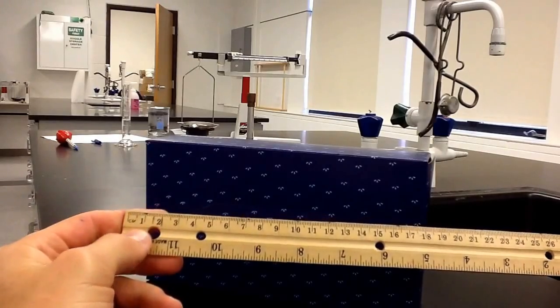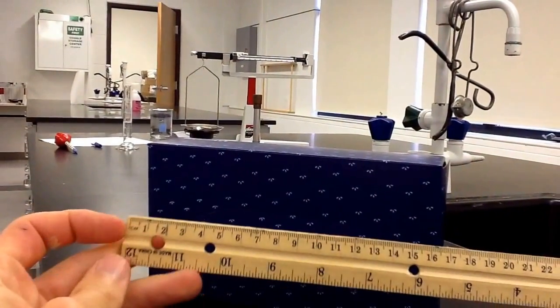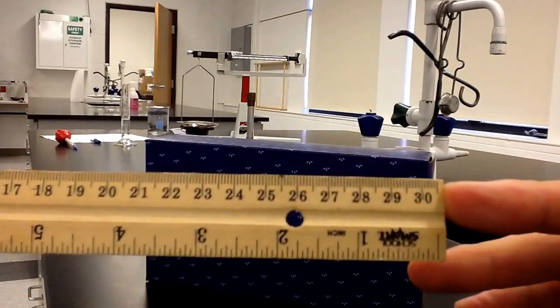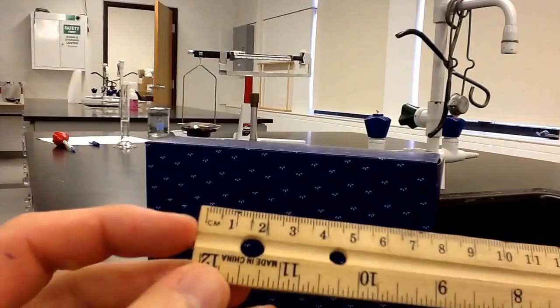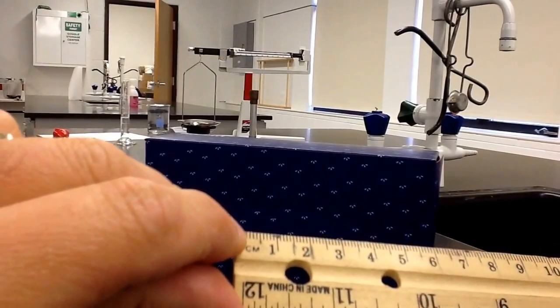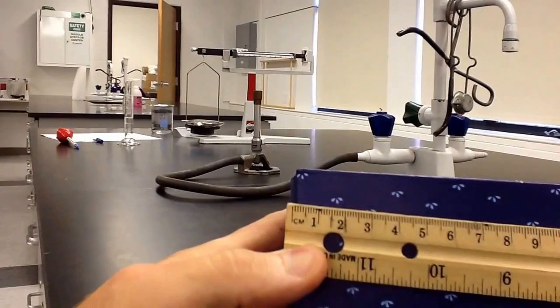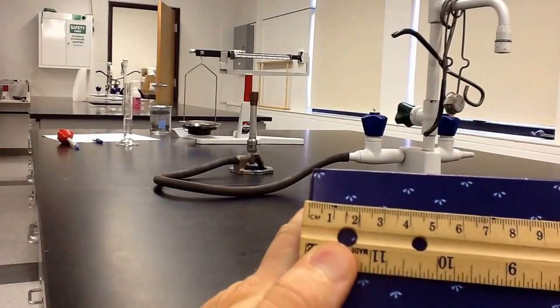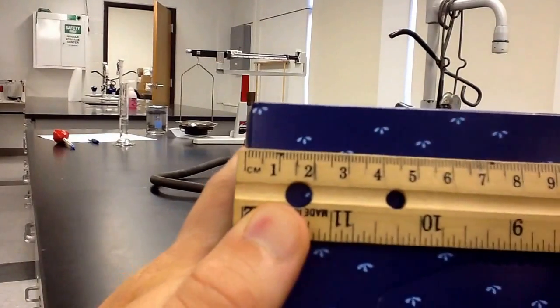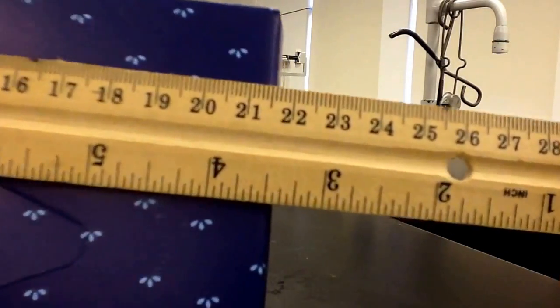The last thing I want to show you is the centimeter ruler. This ruler has both inches on one side — that's twelve inches, one foot — but in chemistry class we're going to use the centimeter side. It says centimeters, and this is thirty centimeters across here. When we use this we always need to make sure that we start at this line right here, not at the very end of the ruler. Each one of these little divisions is 0.1 centimeters. When we measure this box we start right at the line on the end.